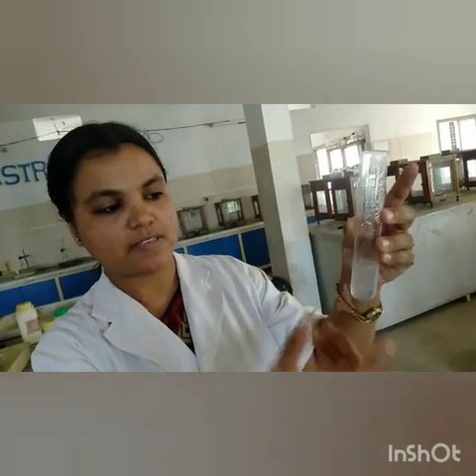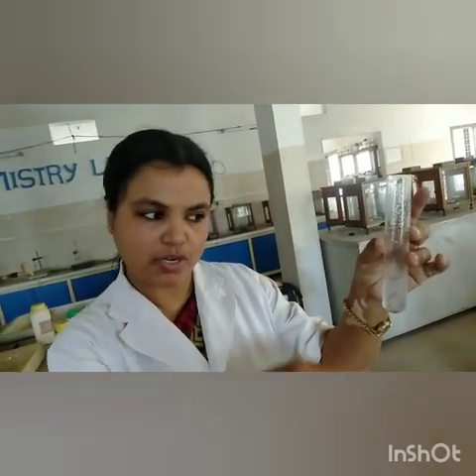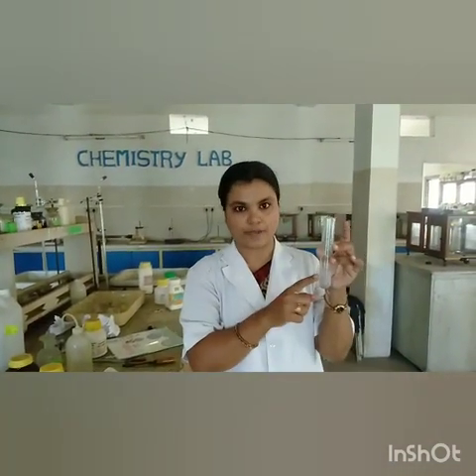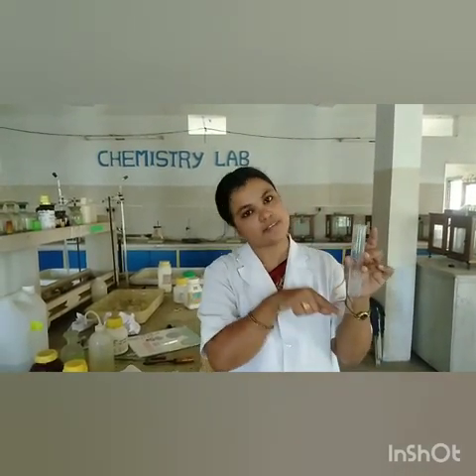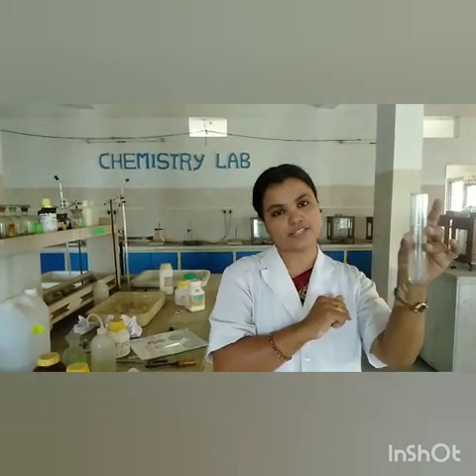The copper turnings are just like that only, indicating that the copper is much less reactive, and because of which it could not displace zinc. So in the reactivity series, it is much below zinc. That's why it could not displace zinc from its solution, zinc sulfate solution. So absolutely there is no change at all.